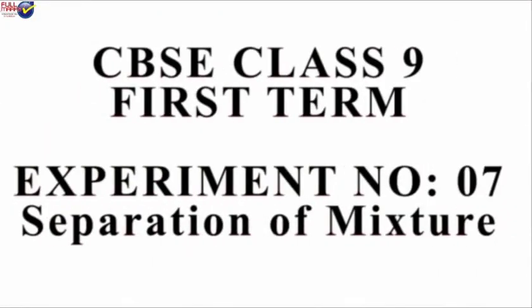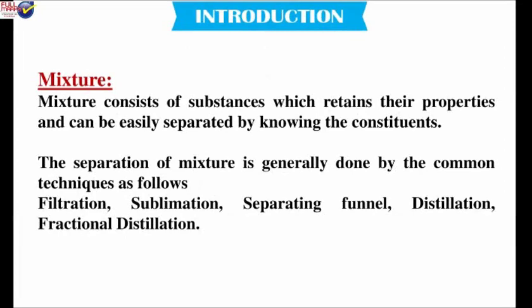CBSE Class 9, First Term, Experiment Number 7, Separation of Mixture. Introduction. Mixture. A mixture consists of substances which retain their properties and can be easily separated by knowing their constituents. The separation of a mixture is generally done by the common techniques as follows: filtration, sublimation, separating funnel, distillation, fractional distillation.